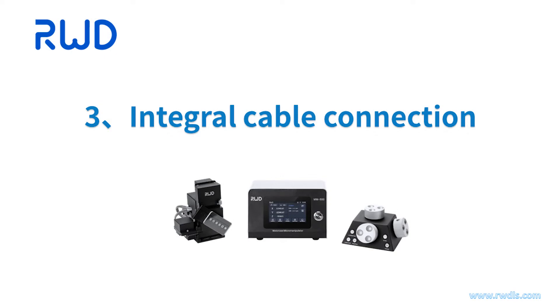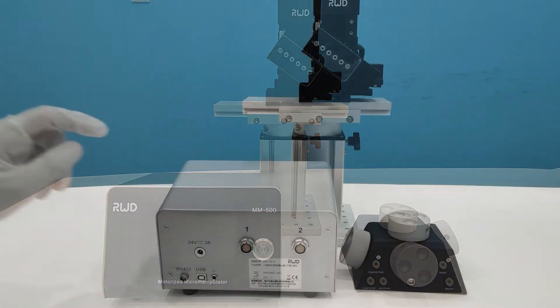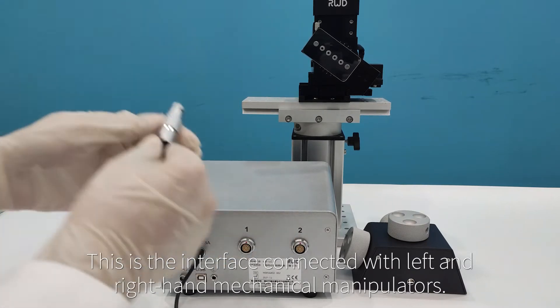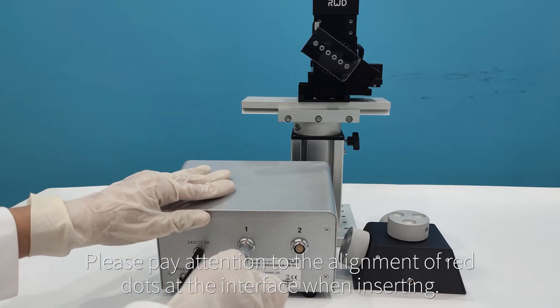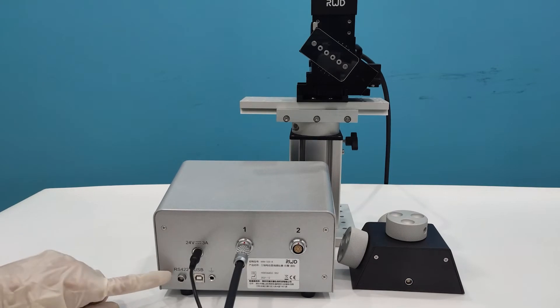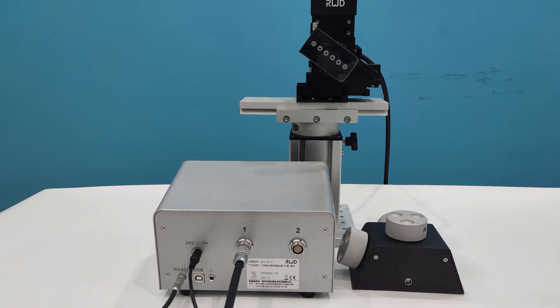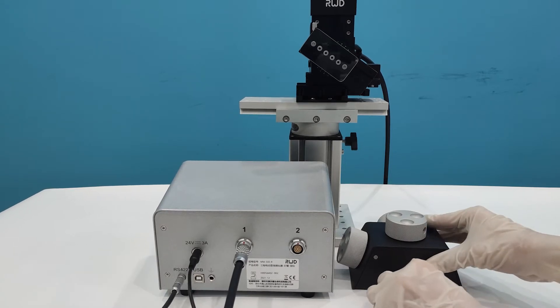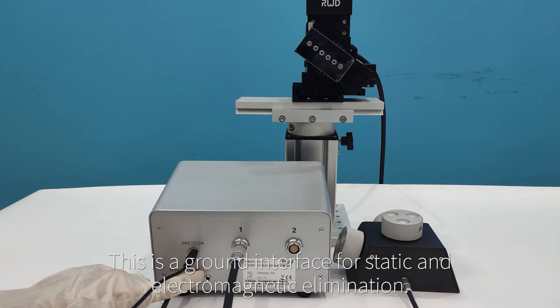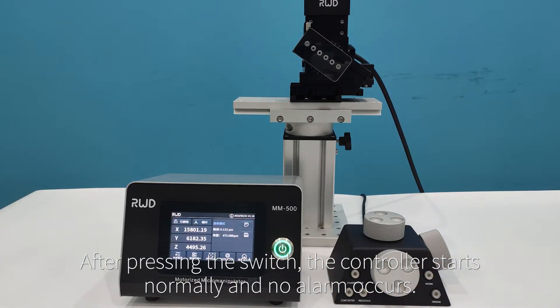Section 3: Integral cable connection. Components to connect include the controller, encoder, and manipulator. Connect the controller power interface and the interface for left and right hand mechanical manipulators, paying attention to the alignment of red dots when inserting. Connect the other end of the cable to the manipulator interface, aligning the red dots. Connect the encoder cable. The ground interface is for static and electromagnetic elimination. After pressing the switch, the controller starts normally with no alarm.